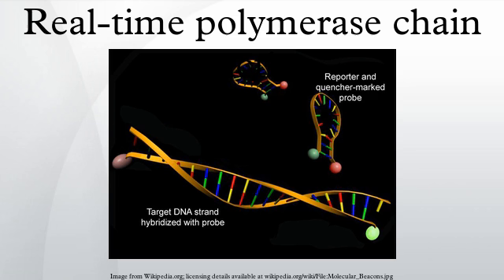Methods such as MAK2 have been shown to have equal or better quantitative performance to standard curve methods. These mechanism-based methods use knowledge about the polymerase amplification process to generate estimates of the original sample concentration. An extension of this approach includes an accurate model of the entire PCR reaction profile, which allows for the use of high signal-to-noise data and the ability to validate data quality prior to analysis.